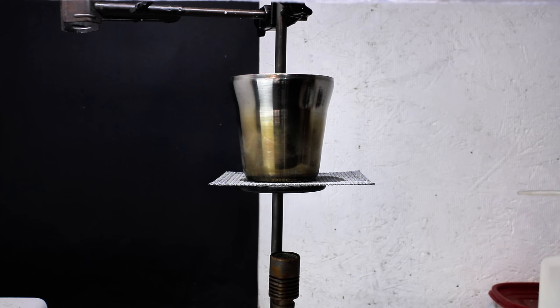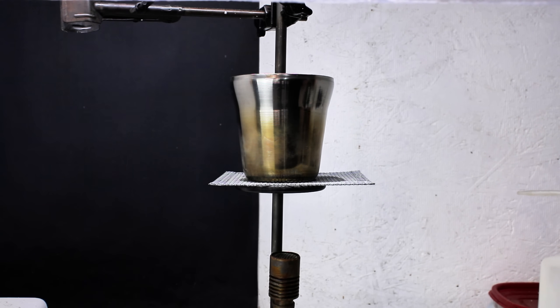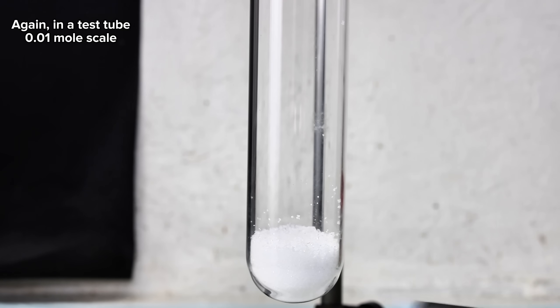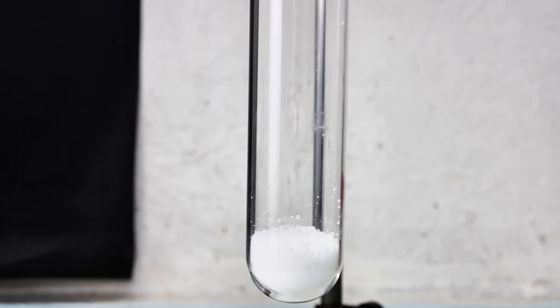At first I expected this reaction to take a decently long time, and so while I was fiddling with the camera and lighting, the salt mixture began to violently react, which was a bit startling. Since the reaction happened all at once and way sooner than I expected, I decided to refilm it in a test tube at a much smaller scale so you can actually see it happen.